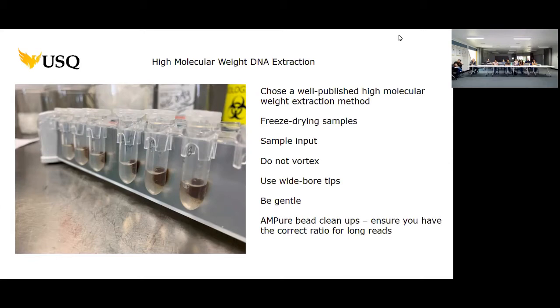Essentially what you're trying to do is get as much DNA out of this as possible. You do need quite a bit of DNA to get through all these processes.